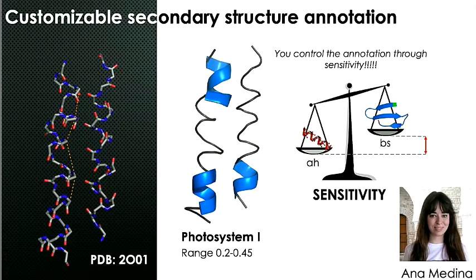But then if you look closer, you will see that there are really strong and major errors on the position of the atoms, and the hydrogen bonds are not actually formed. So we should not classify them as alpha helices. But of course, these two fragments cannot be anything else than alpha helices.